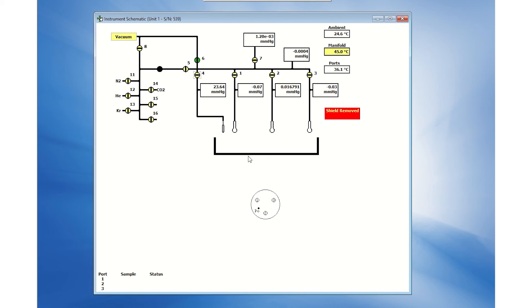After two or three freeze-thaw cycles, pressures in the range of 10 to the negative fourth or fifth millimeters of mercury should be achievable when evacuating over the completely frozen vapor source. When the pressure stabilizes near the actual vapor pressure at room temperature, once the vapor is thawed, the vapor is ready for analysis.